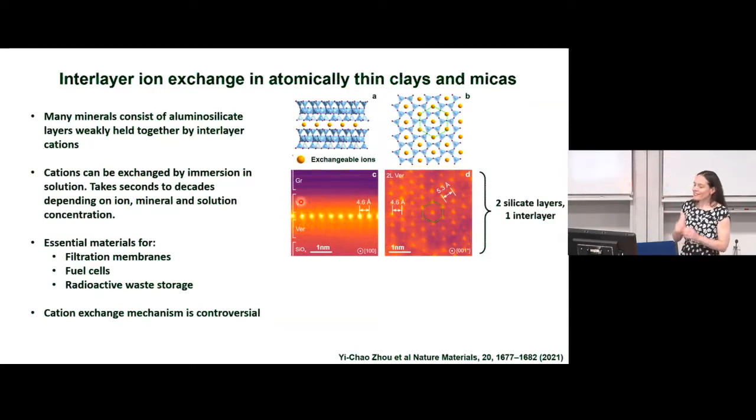So we can see that layer of ion exchanged cations, cesium cations. In order to prepare this and put it into a transmission electron microscope, I've taken that bilayer specimen, which is on a silicon oxide substrate, and that's shown underneath here. We've encapsulated it with a graphite layer just to protect it, and then we've used a focused ion beam to slice through it, pick up that slice in cross section and put it into the transmission electron microscope.